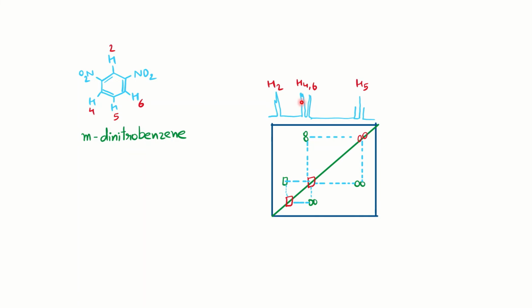So this type of proton NMR we can assume for the meta-dinitrobenzene. But here we are talking about homonuclear COSY. On the y-axis also you will have the same, and this is the two-dimensional NMR. We have diagonal peaks here and cross diagonal peaks. Since we take out the coupling information, which proton is coupling to which proton, that information we'll get from here.